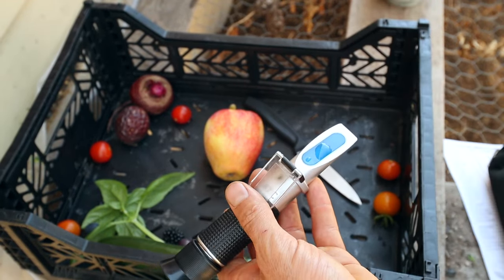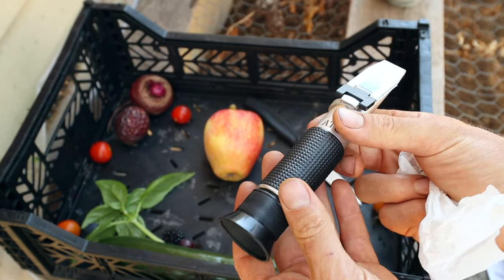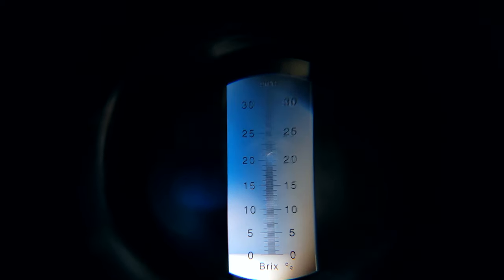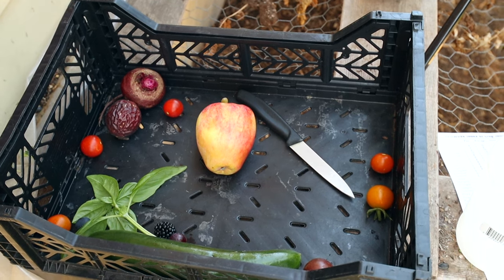Just to show you how this thing works — if I put straight water on there, that's not going to have a reading, right? It should read zero. Looking at our reading there — that's at zero Brix because it's water. So we know it's calibrated correctly.